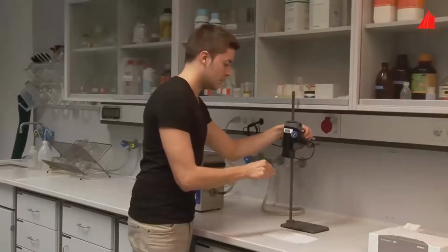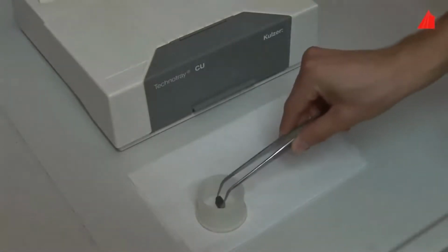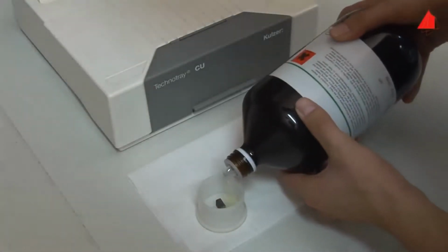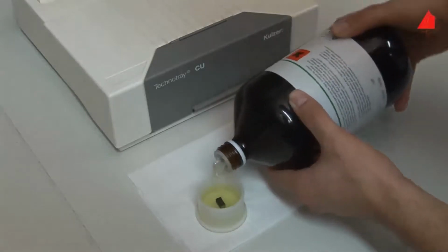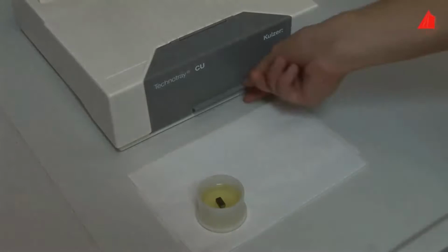To mount the specimen, small plastic molds are suitable. The material tester picks up the clean specimen and carefully places it into one of the molds. The intended plane of examination is at the bottom. Then he pours liquid resin into the mold. A thin layer of grease at the inner surface of the mold acts as a release agent. This ensures that the cured resin can later be released easily from the mold.